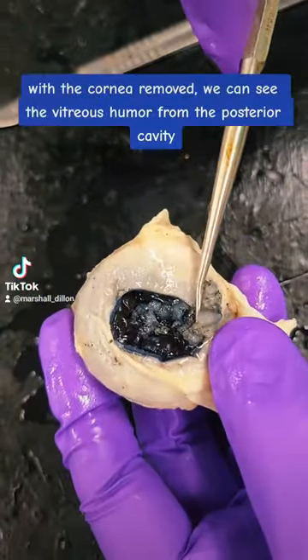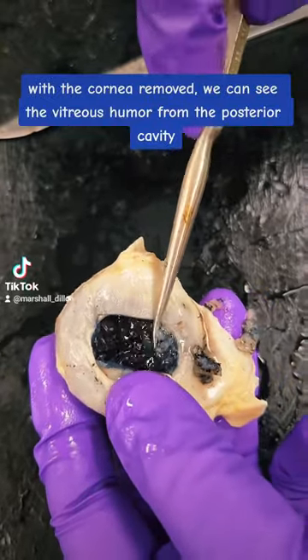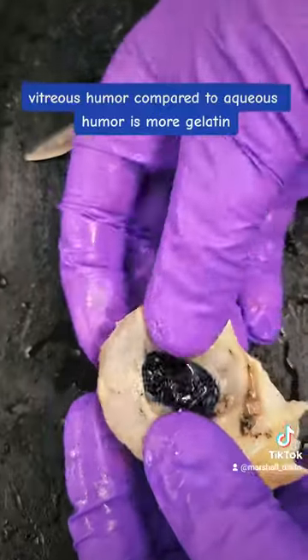With the cornea removed we can see the vitreous humor from the posterior cavity. Vitreous humor, compared to aqueous humor, is more gelatin.